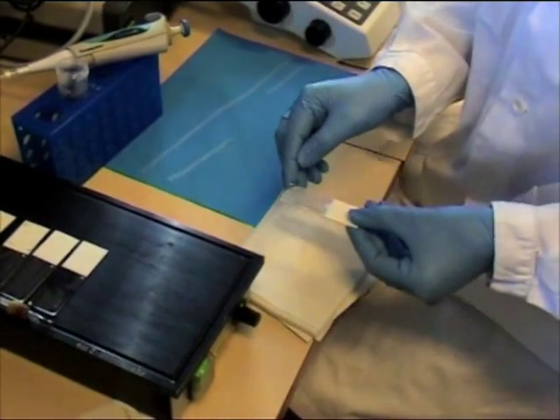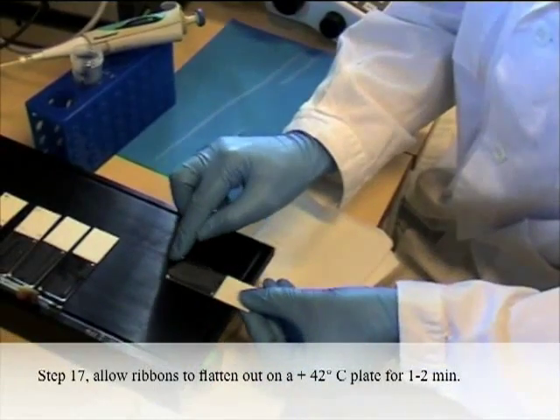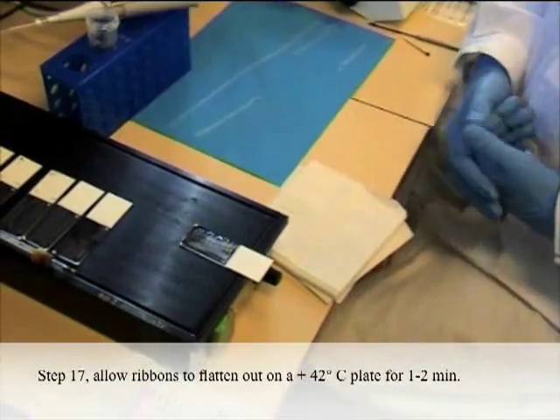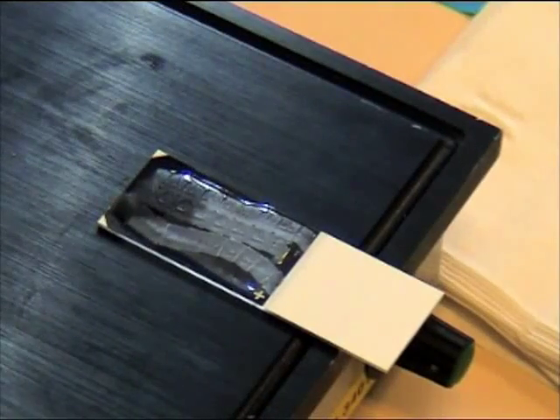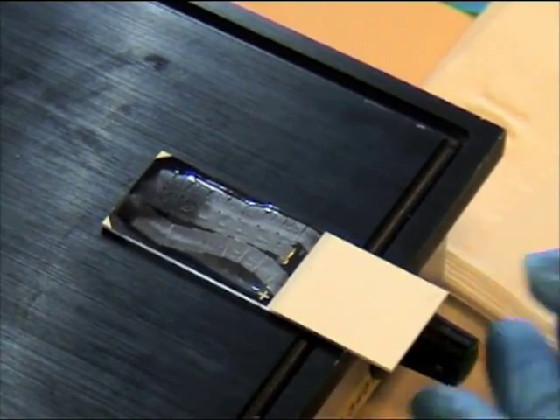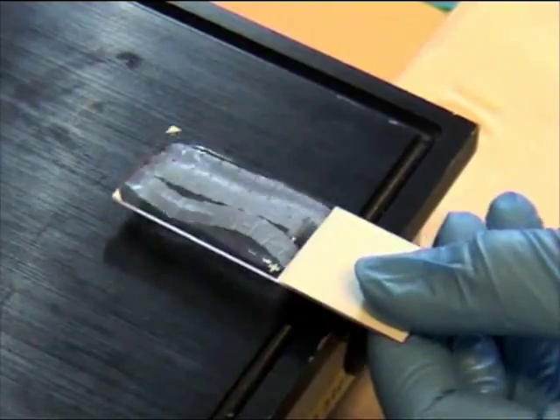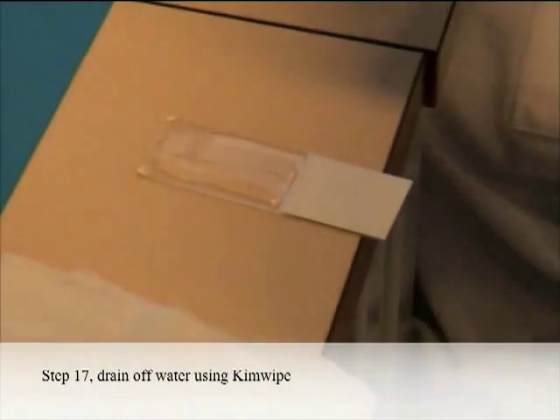Move the slides to the hot plate. Step 17: Allow ribbons to flatten out on a 42 degrees centigrade plate for 1-2 minutes. Drain off the water using Kim Wipe.